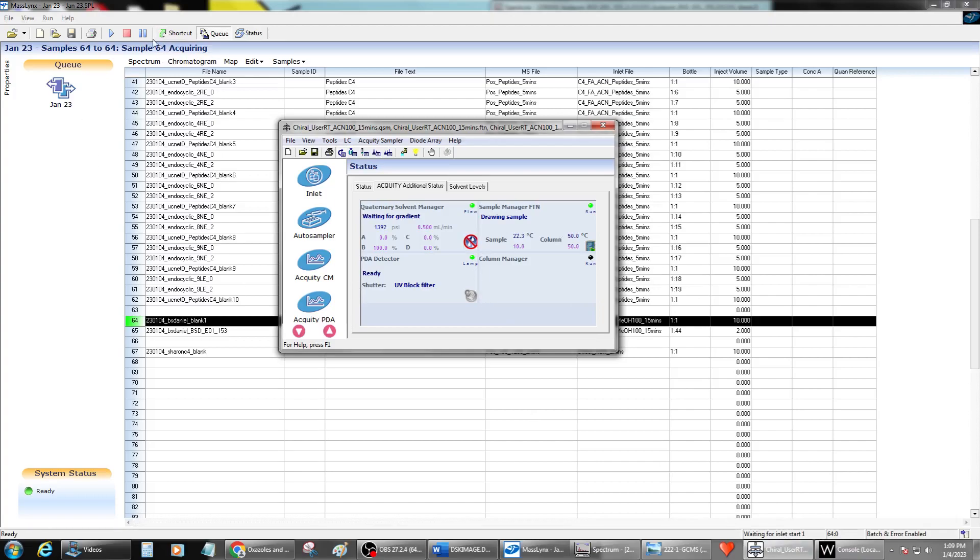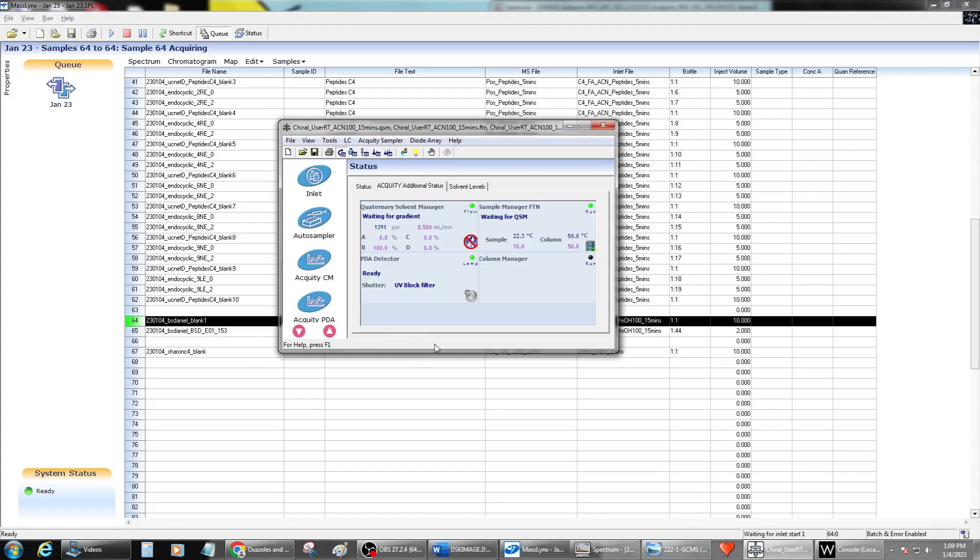So typically in that situation, I will then pause the queue and delete this from the queue again. And then I will close the mass link software and then reopen the software and then change the name of the run again and go ahead and resubmit it. That typically fixed it, the opening and closing the software. But this seemed to work. I hope that helped.